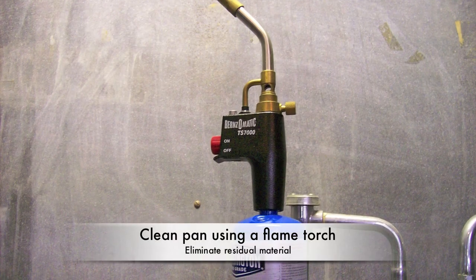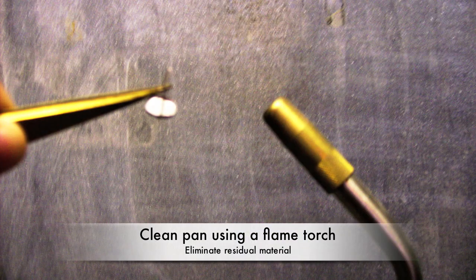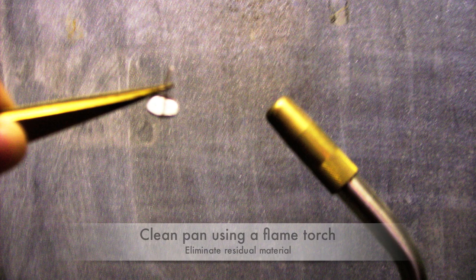If the pan needs cleaning, hold it with tweezers and use the flame torch to eliminate any residual material that could disrupt testing.